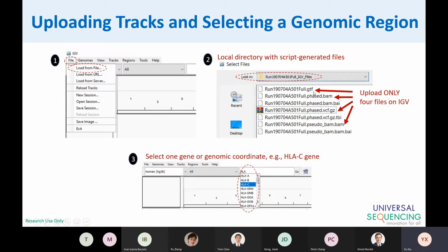So the read here belonging to haplotype 1 is only valid in this phase block. Same thing in this phase block. So if your read is assigned to haplotype 1, this is only valid in this phase block.